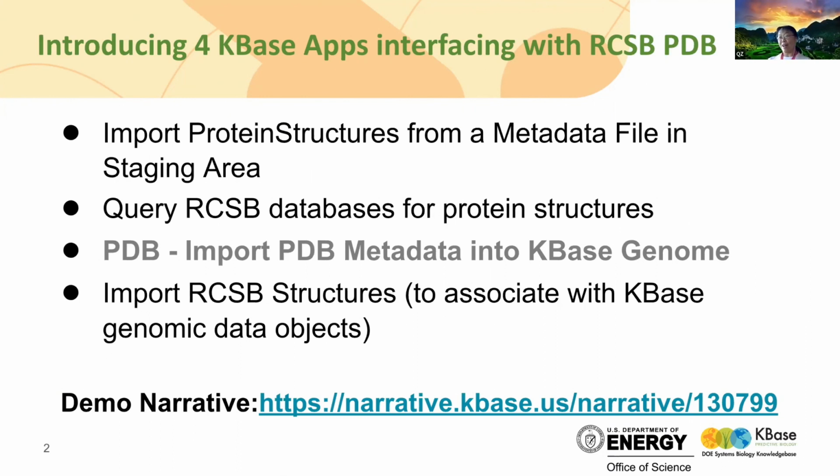Not only do we have reference genome, reference data, I know that because I loaded many of those data into KBase, but we also have users' specific isolates, and individual users can upload their data into our KBase system. So now we all know the potential.